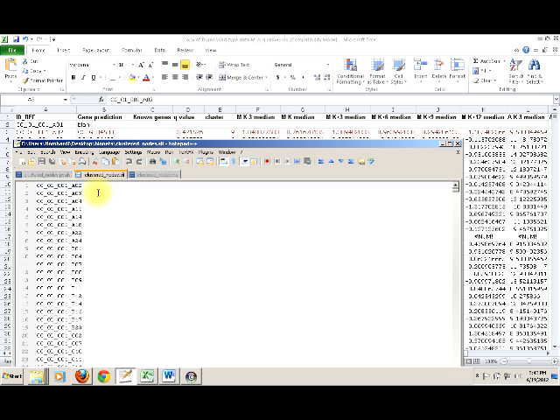The first file format is clusterednodes.sif — a SIF file that records interactions. If your nodes don't interact with anything, it's basically just a long list of nodes. The first one in the list is the same gene that's highlighted in the spreadsheet. The SIF file records all of the nodes we care about, and each node in this case represents a gene.